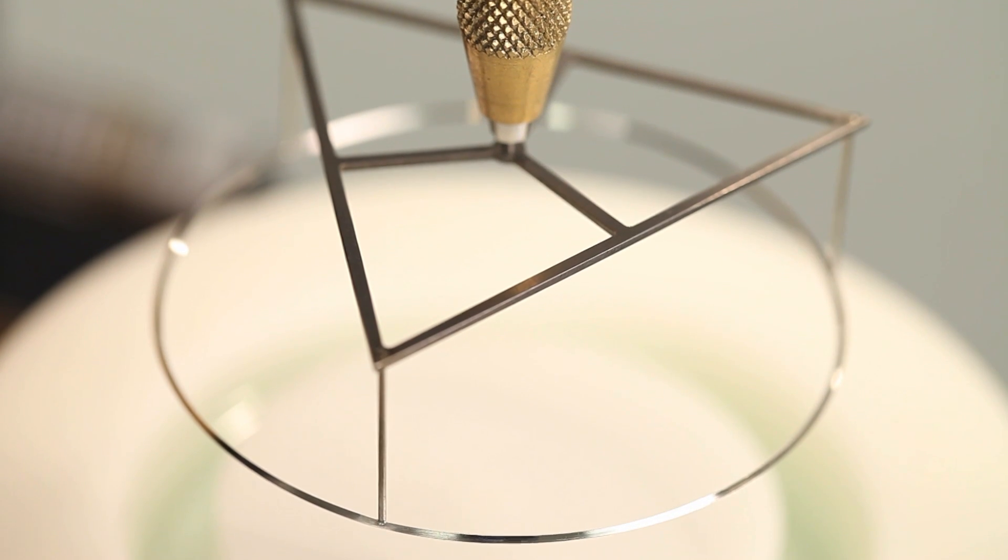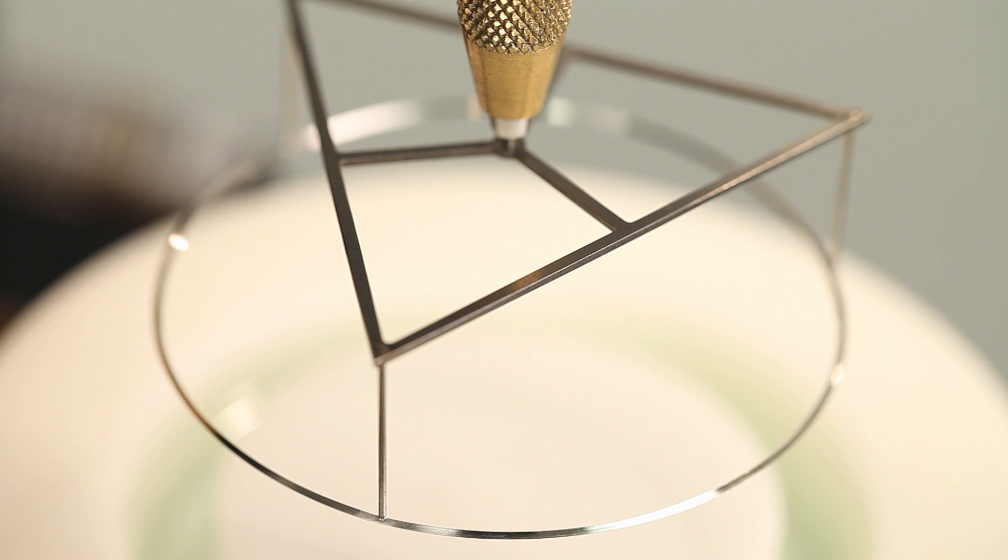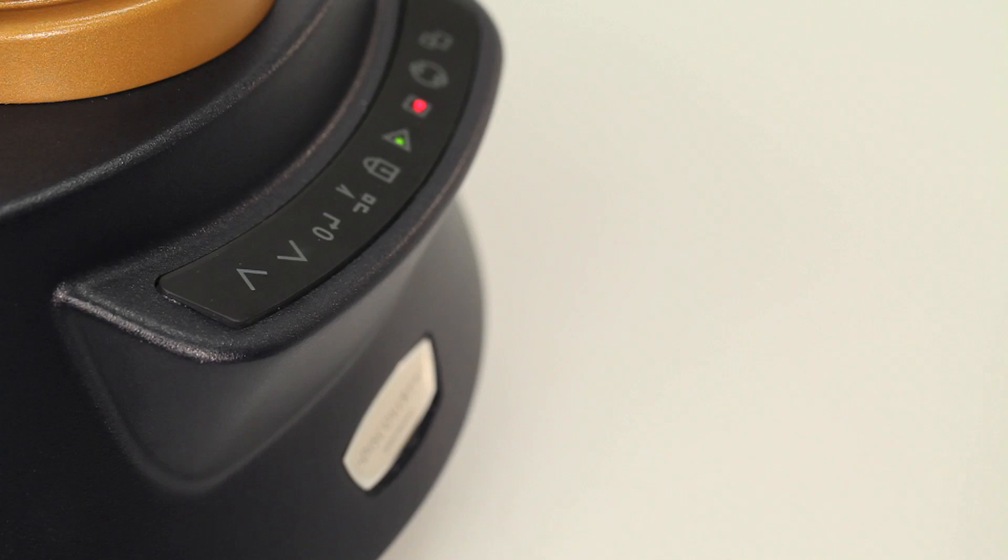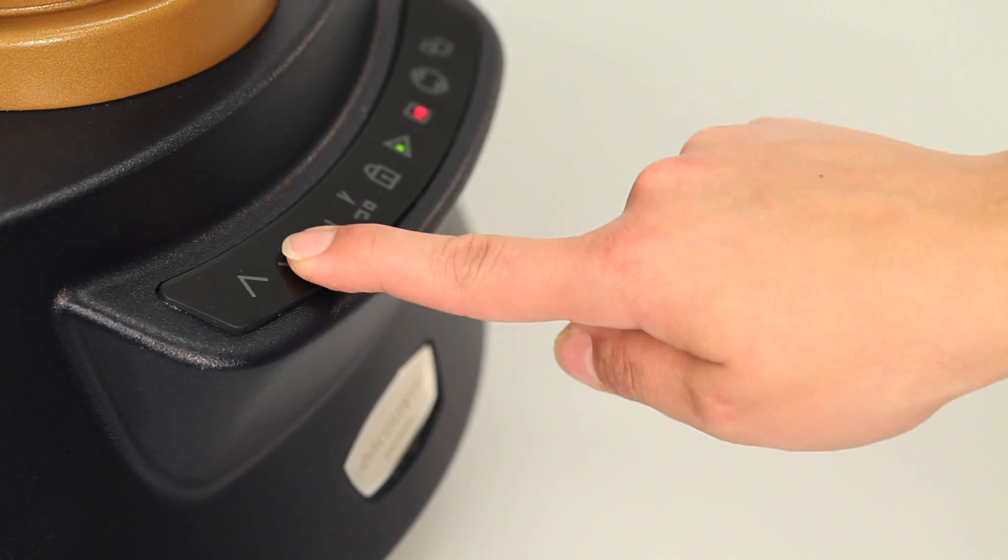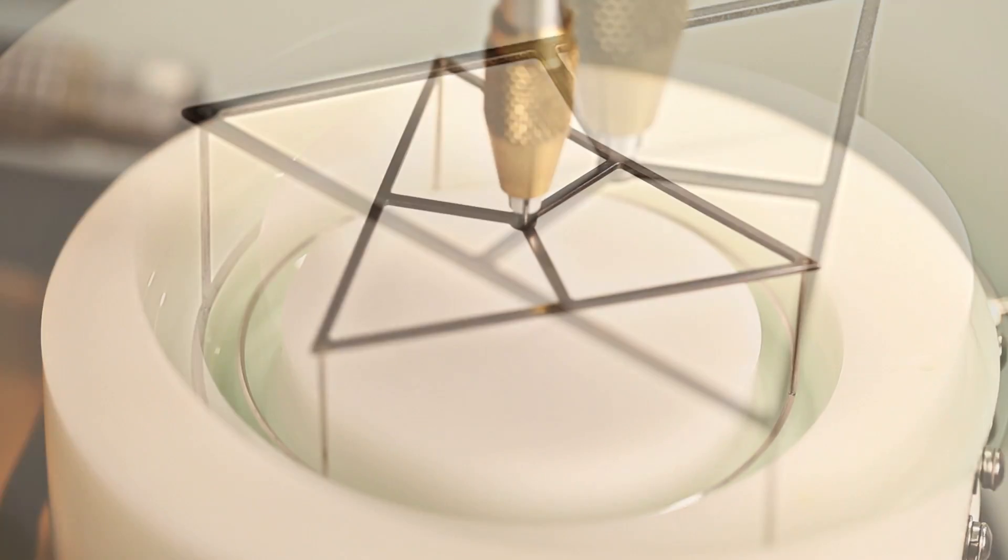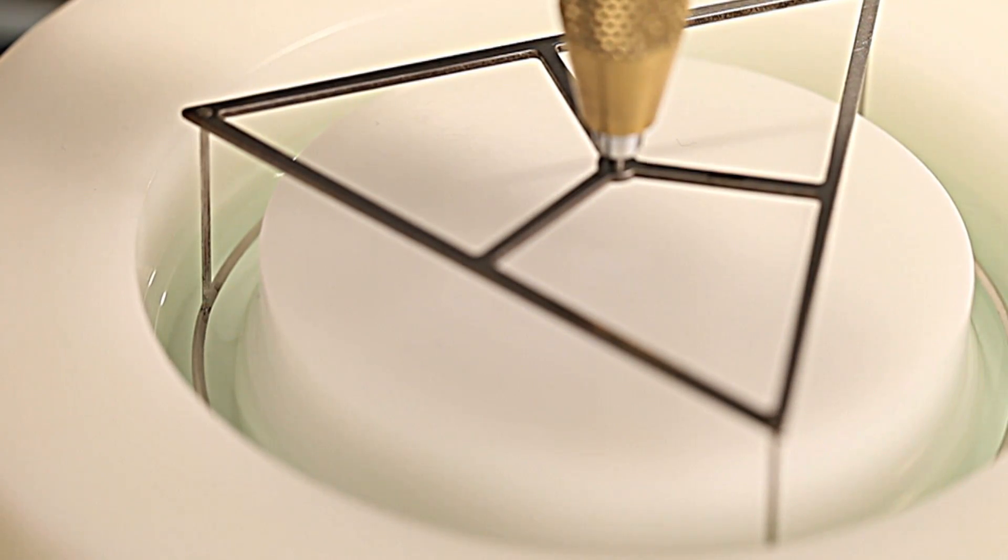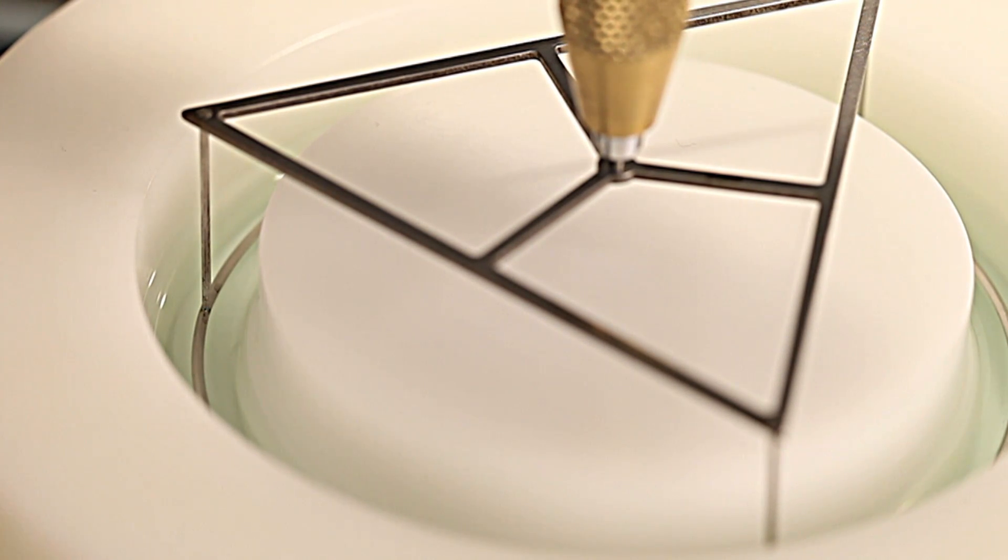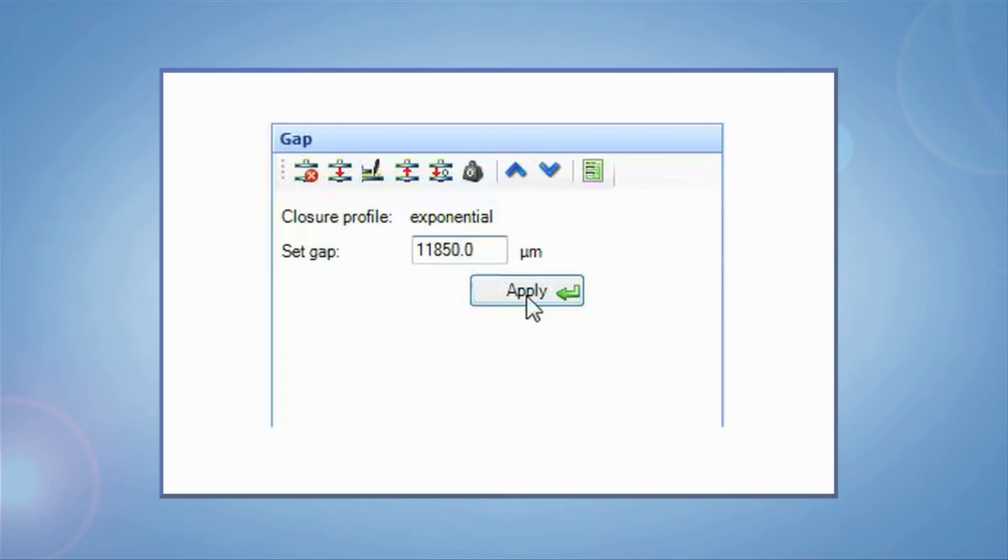The double wall ring must be positioned so its inner and outer edges are at the same level as the interface. You can do this by manually lowering the ring and watching visually for the point of contact. When the bottom edge of the ring touches the sample, you'll see the surface climb up the sides. Once this happens, you can lower the ring down by 500 microns or half the height of the ring so that it is positioned at the interface.